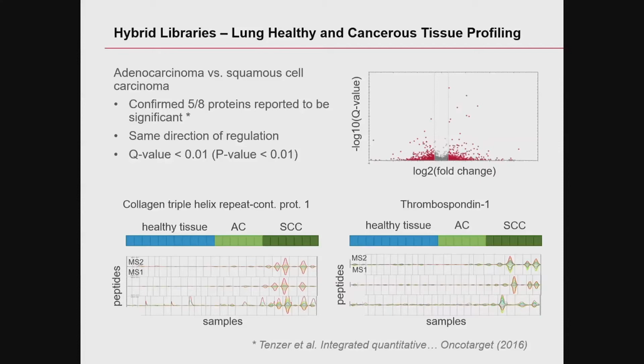And interesting was that we could really separate cancer subtypes from each other in terms of proteins that are differentially regulated. And that's, of course, the more interesting part, because if you're thinking along the lines of personalized treatment of these cancer patients, you would like to read out as much information in terms of subclasses of cancers from these patients to be able to make a good prediction which medication would work best for each of the patients.